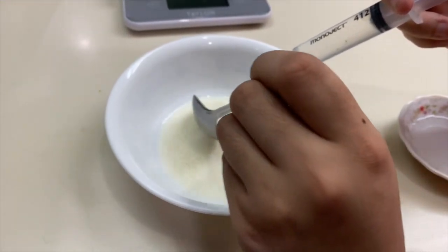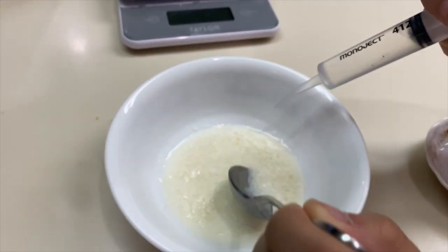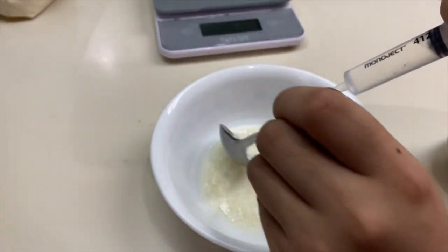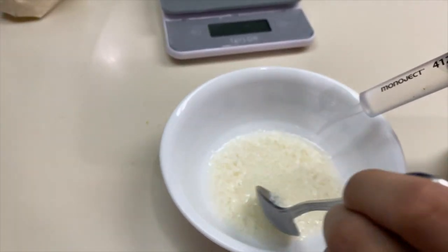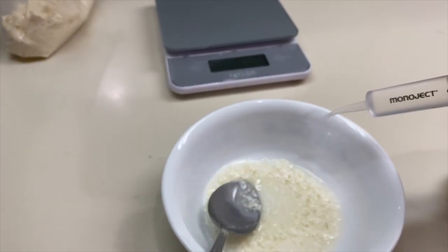Add drop by drop acetic acid, which is vinegar, while stirring the milk suspension. Observe the formation of precipitates. The purpose of adding vinegar, acetic acid, to the milk is to lower the pH of the milk and for the protein casein to reach its isoelectric pH.